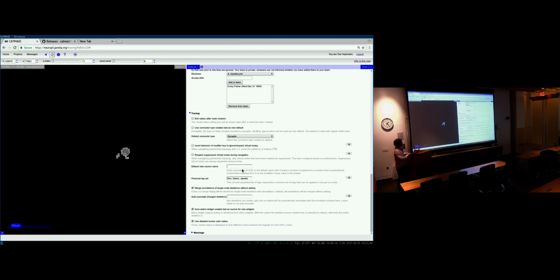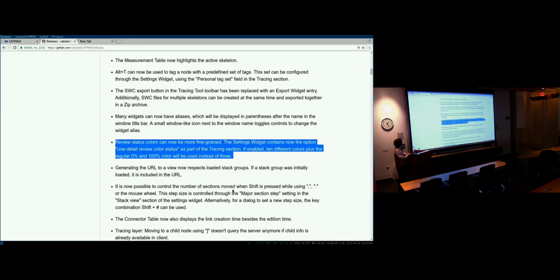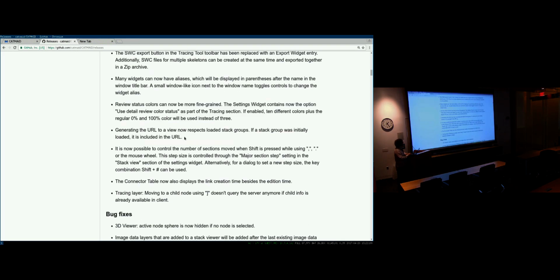And this is respected in all widgets that show review status. So that's the same. In the selection table, you also have this column for reviews, right? And it also uses this coloring scheme. Let's see, what else? Not so relevant here, but mention it nonetheless.